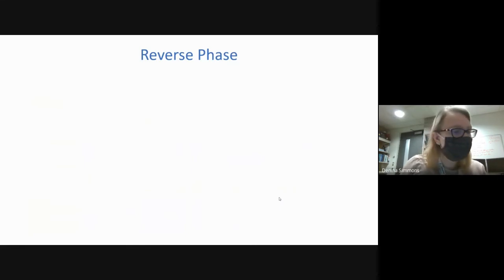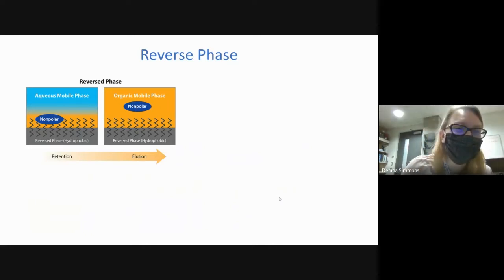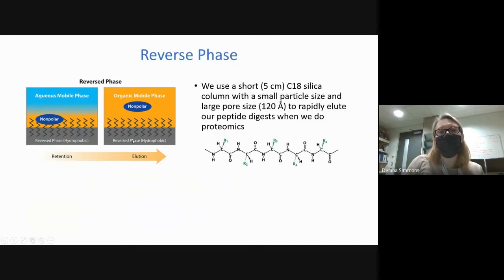So let's talk a little more about reverse phase. I've gone on and on. You probably feel like you already know more than you want to know about reverse phase chromatography. Oh well, there's more to know. So this is just a nice visual for what this looks like. You have an aqueous mobile phase, you have a nonpolar solid phase, and over time, you're starting with this aqueous mobile phase, you increase the organic mobile phase, and the analyte that is nonpolar and wants to stick to the hydrophobic stationary phase comes off in the mobile phase.